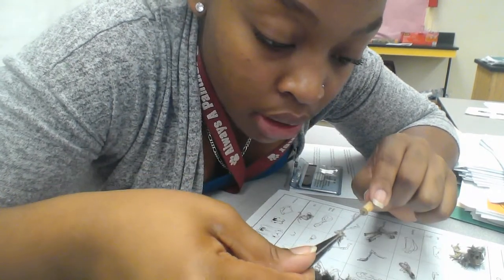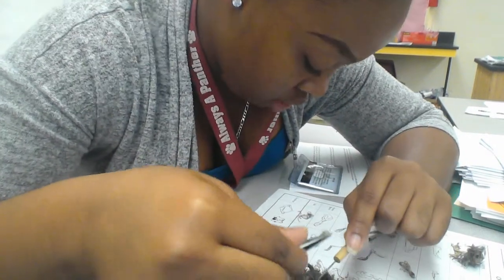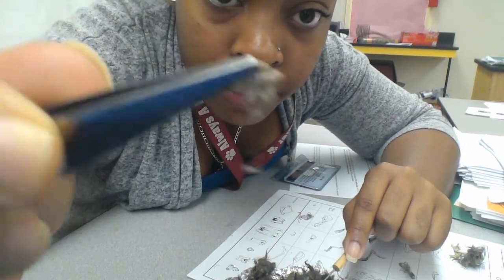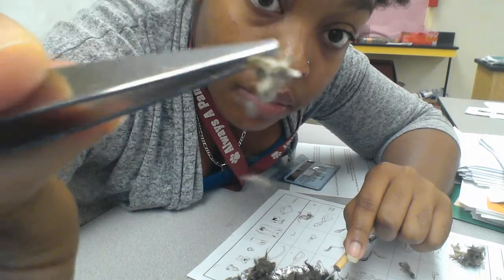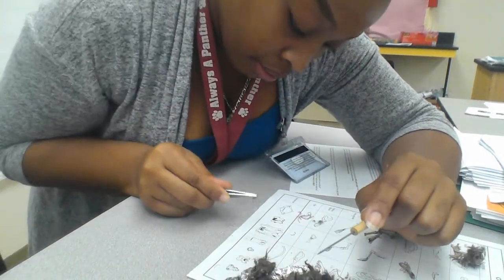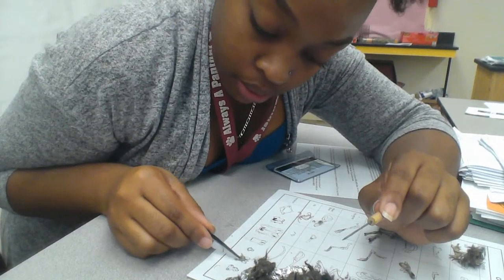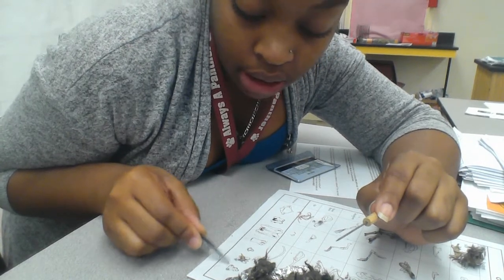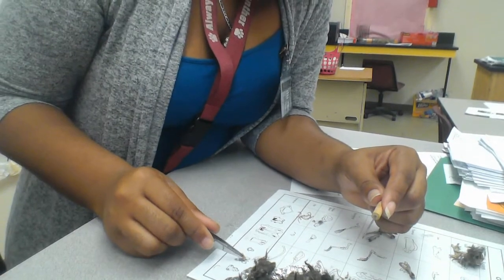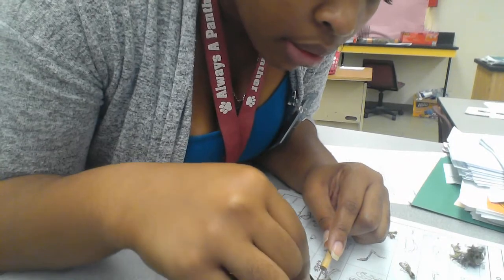Okay, this is a little different. This is part of the vertebrae. One of these. Vertebrae. So looking at this, I would say it's the one that's second to last in that row. Or it could be this big one. But no, second to last. Definitely second to last. What's this?